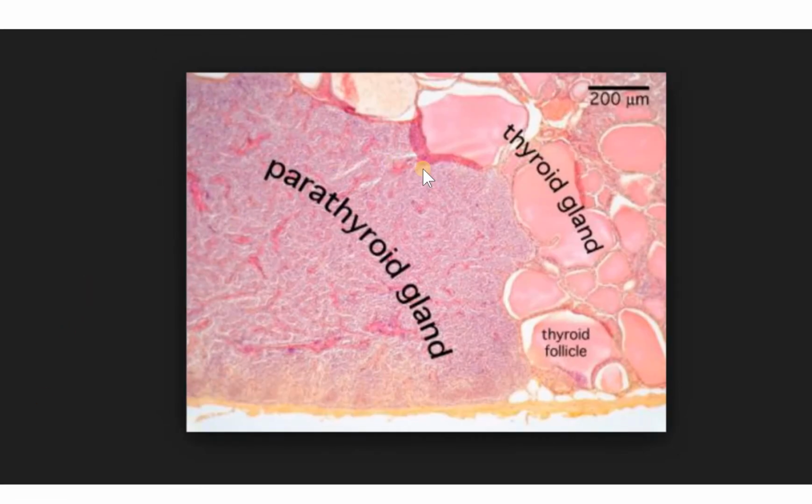On this slide, you will be able to see part of the thyroid gland over here. Okay, and here's the parathyroid. So this would be a posterior part of that tissue. And they took a sample. We tried to collect most of the parathyroid gland. Of course, they're going to get some thyroid tissue in there. You can see the follicle. Okay. You can see the parafollicular cells here and the follicular cells that surround the follicle. Okay. But this is what the parathyroid gland would look like.